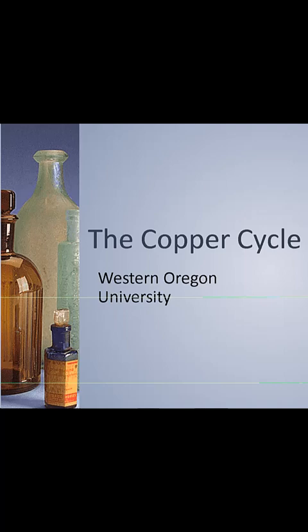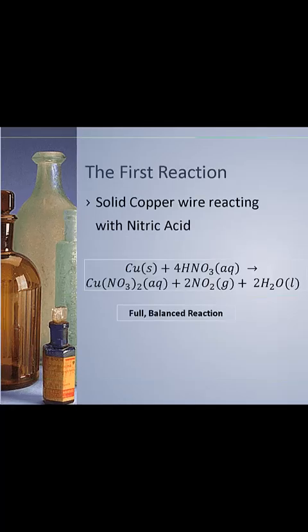Today we're going to walk through the copper cycle. The copper cycle is a series of reactions that takes solid copper and does a number of conversions into liquid and other solid states to return us to elemental copper.